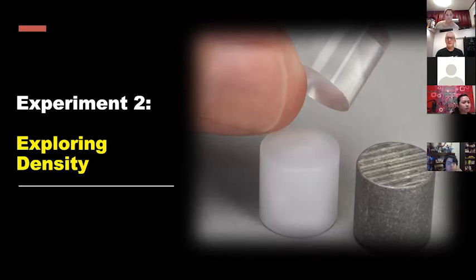Hopefully you got that answer right in the quiz. It's table sugar that you were supposed to bring for this particular one. We're going to be using about 250, 300 grams or so, depending if you spill any. So let's look at some of the background here.